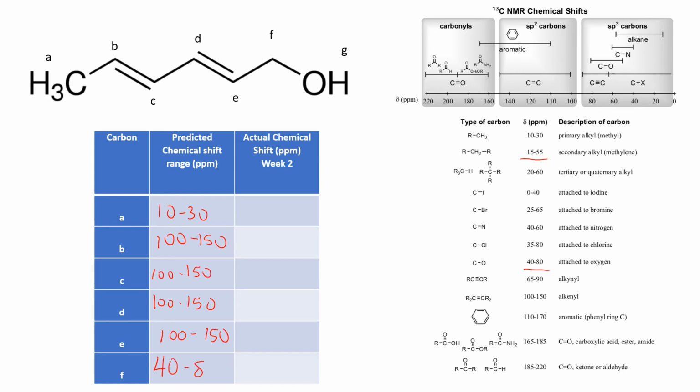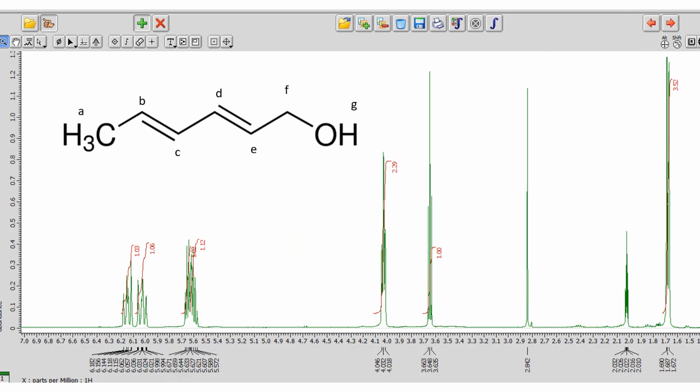So something like that. Okay, so we're going to use HMQC to assign these, which is a really nifty tool. It relates the proton NMR, once we assign all of those, to the carbon peaks, all right? So it works really well. So that's the plan with that.